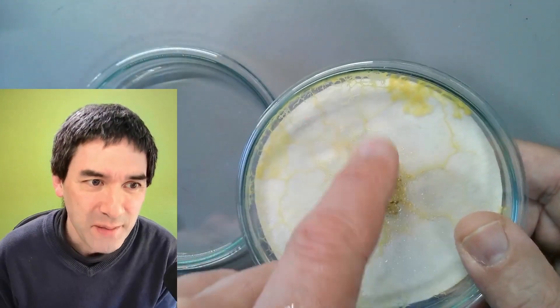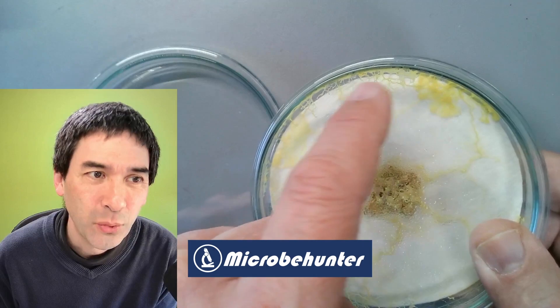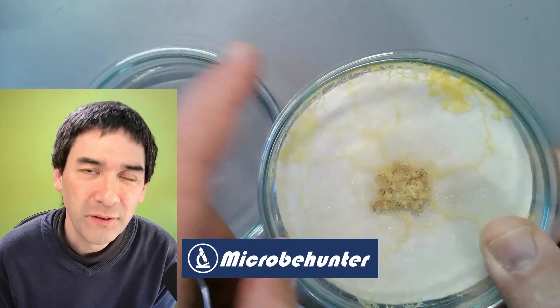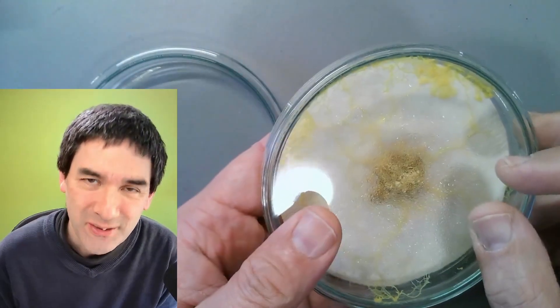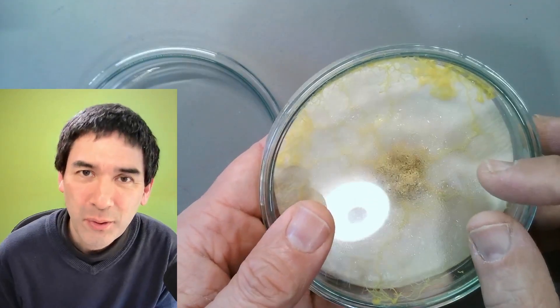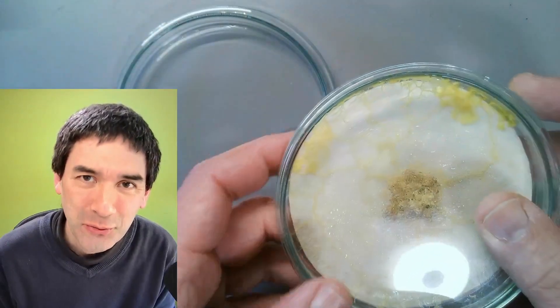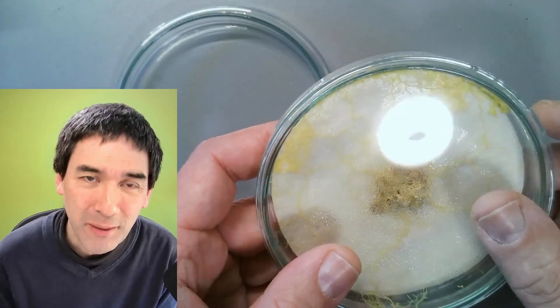Look at this here — this is a slime mold and it's trying to escape. It's now even growing on the surface of the petri dish lid. Hi, hello and welcome — Microbe Hunter here. Today I want to transfer this slime mold to a new petri dish. I'm going to show you how to do that and of course I'm also going to put it under the microscope.